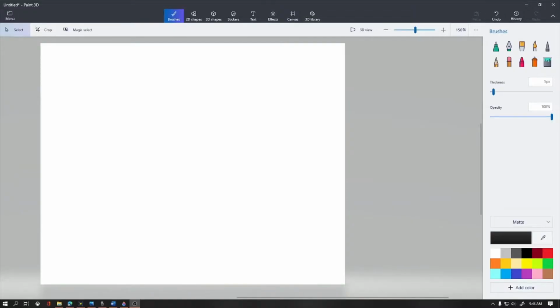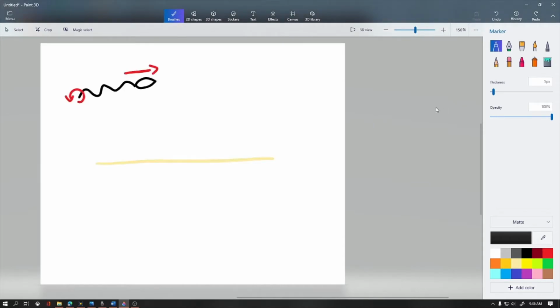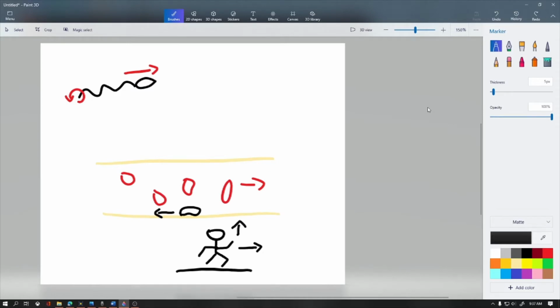My focus in this video is to show how researchers quantify these movements and what we learn from studying cell movement. Of course, for a cell to move, whether it be a sperm cell or a white blood cell, it has to be exerting some amount of force, just like a person walking has to exert a force to fight gravity or air resistance, which is why the technique I'm discussing today is referred to as traction force microscopy.